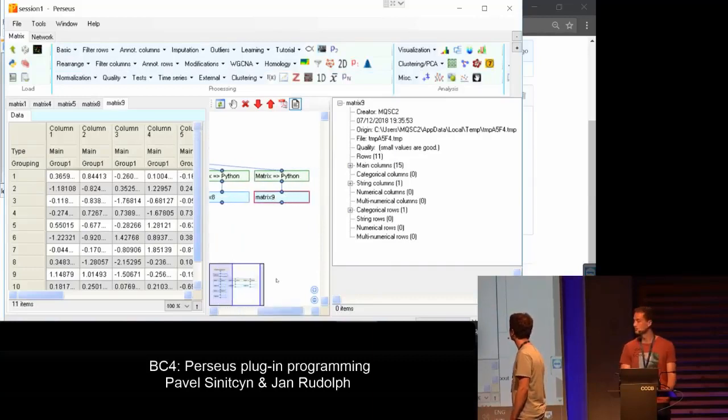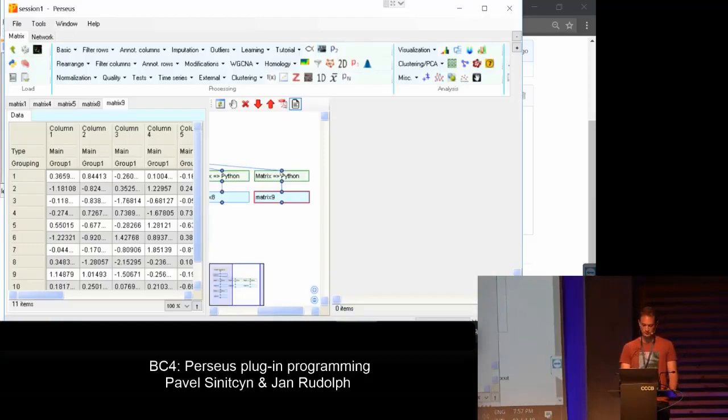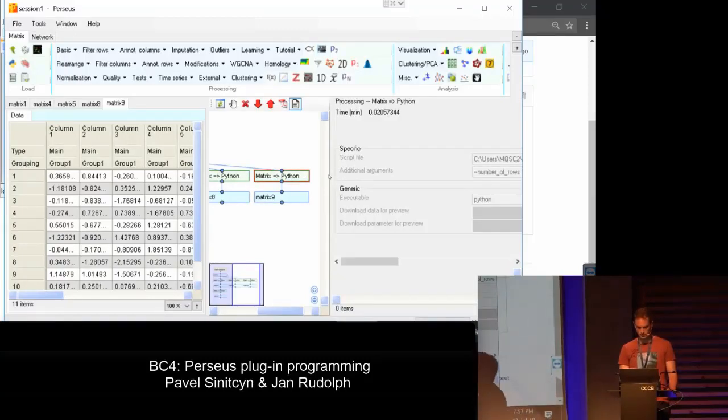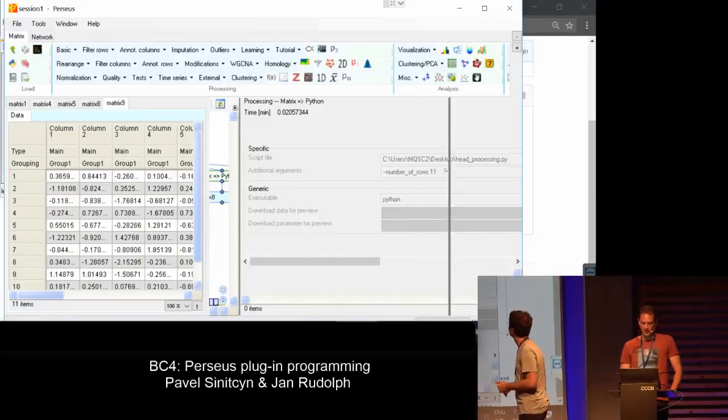Can I ask you one thing? Can you click on activities? Usually in Perseus, when you click on activities, you see more additional things. Basically you can see what you wrote before, which is really, really useful. You can see how you created this much better. Yep, cool.